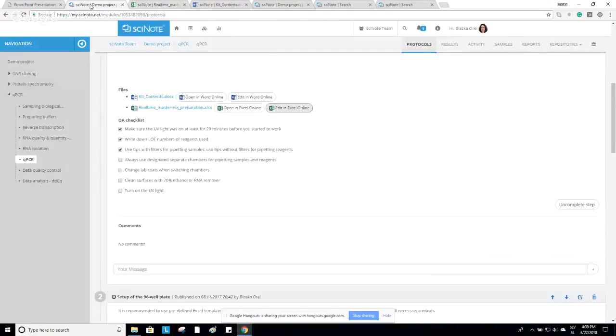So it's basically the same as Google Docs. Okay, so another question was from Relia. Tell us more about new improved SciNote manuscript functionality.